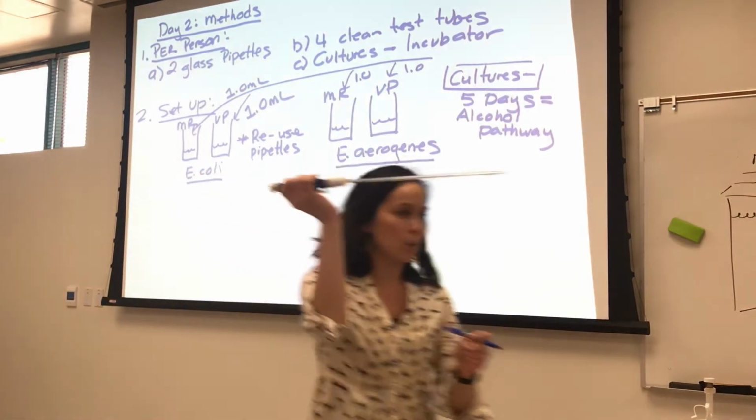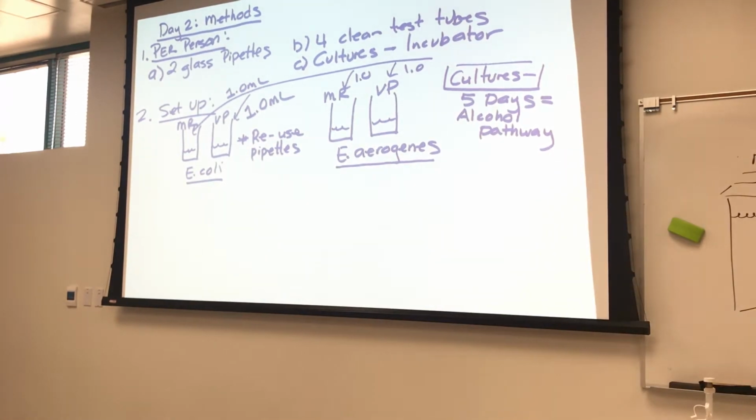So the way these work is once you snugly get them in there, there's a wheel that you put your thumb on, and you just slowly wheel it down. As you wheel down, the fluid gets sucked up into the pipette. When you have to release it, you just push your thumb down on the top and the liquid comes shooting out that way. So the wheel is what draws up your liquid as you thumb it downwards.